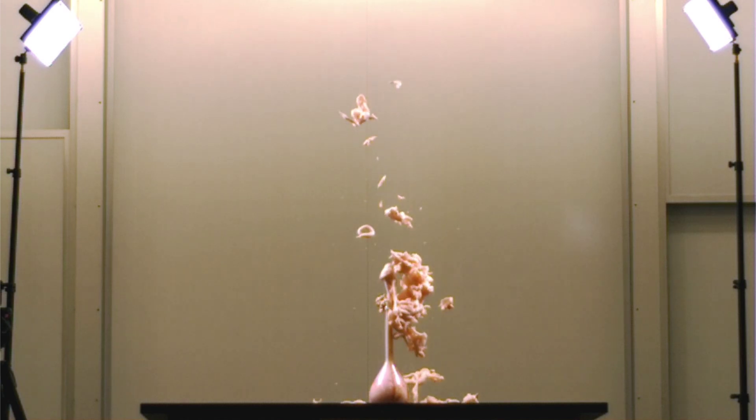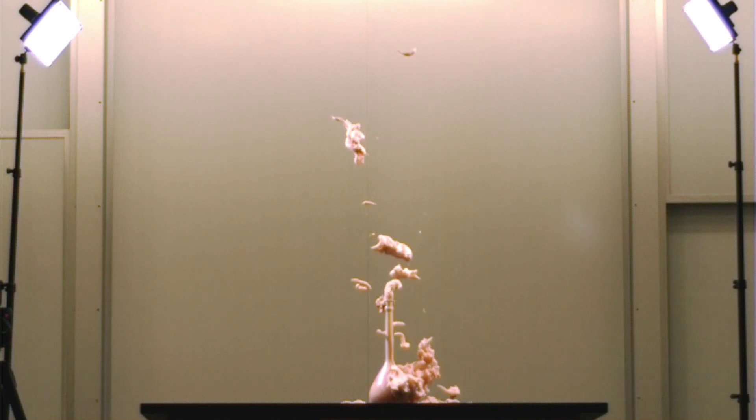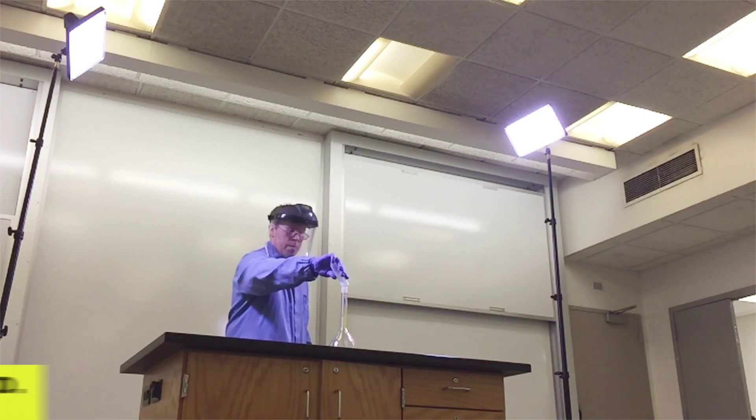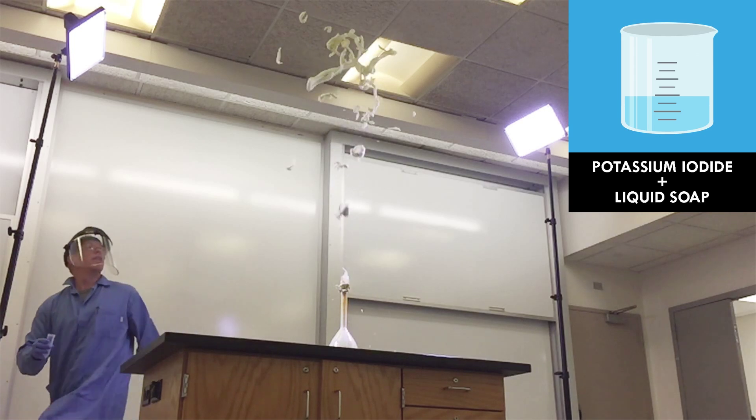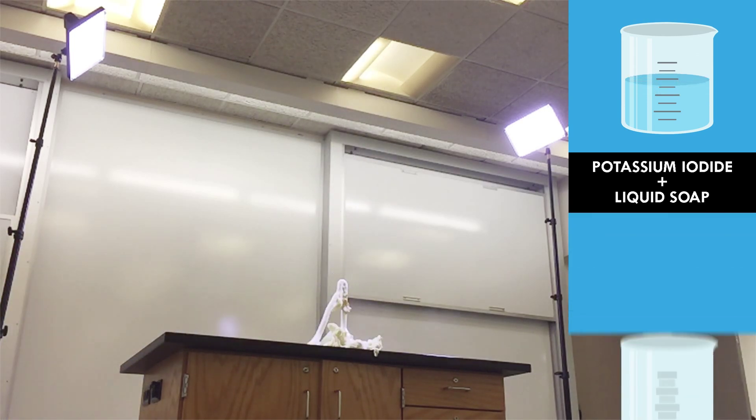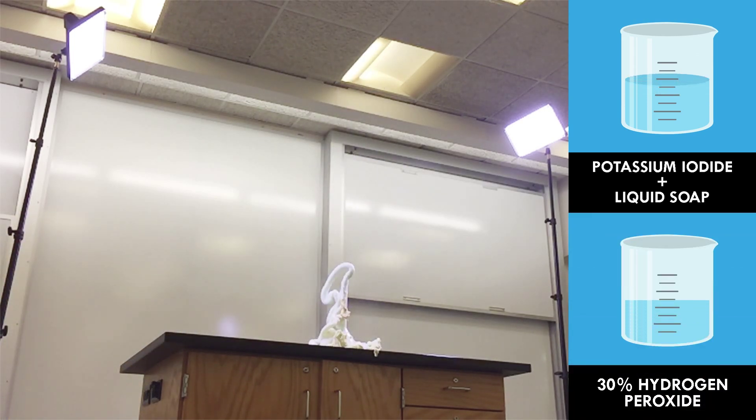What's really happening here is a great demonstration of catalysts, things that speed up or kickstart chemical reactions. Chemistry professor Matt Hardings is adding a potassium iodide catalyst and some detergent soap to a solution of 30% hydrogen peroxide.